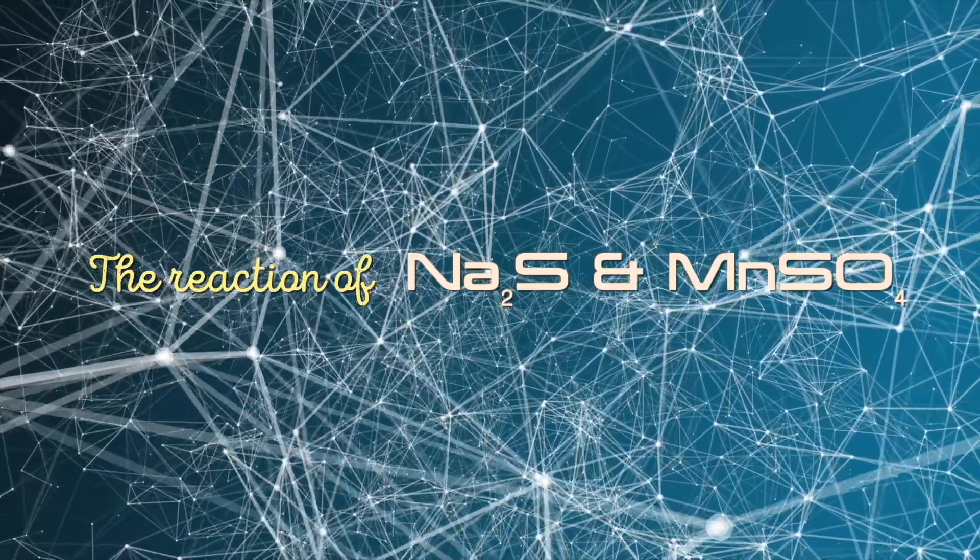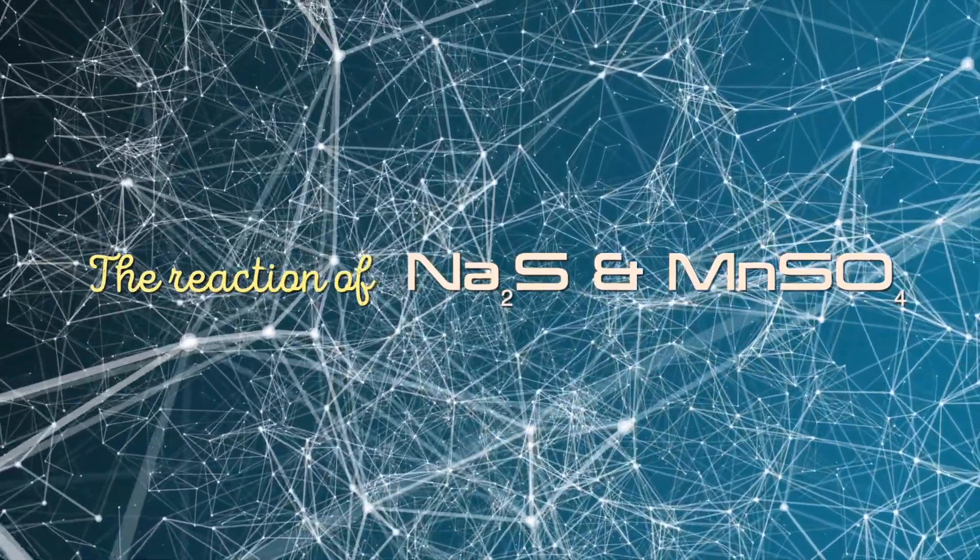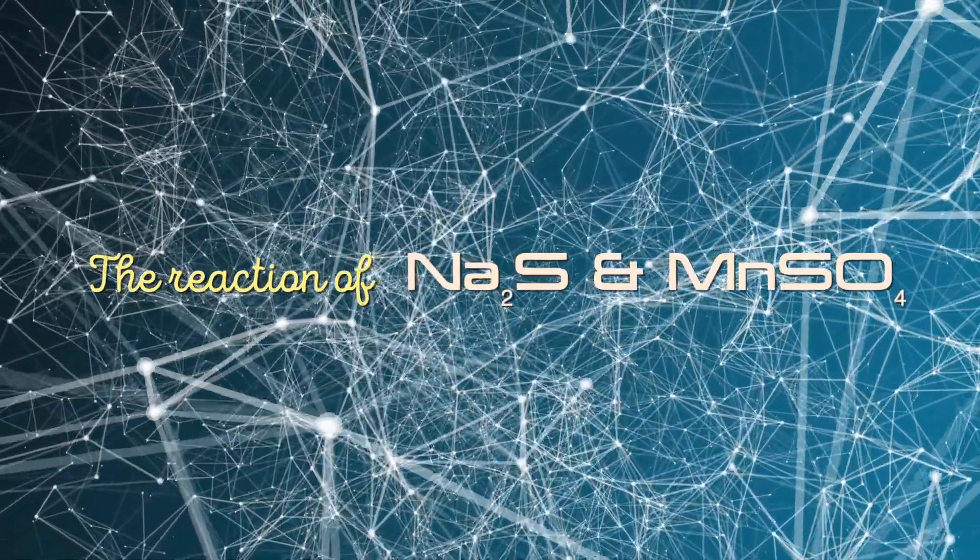Today we are going to observe the chemical reaction between sodium sulfide and manganese sulfate.